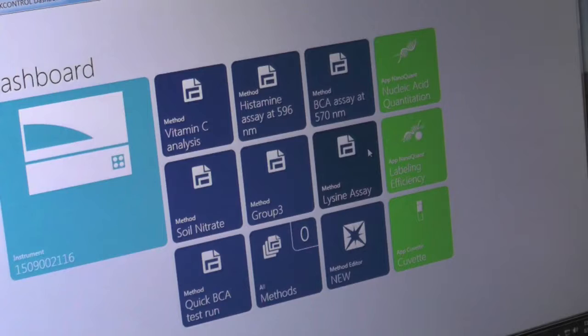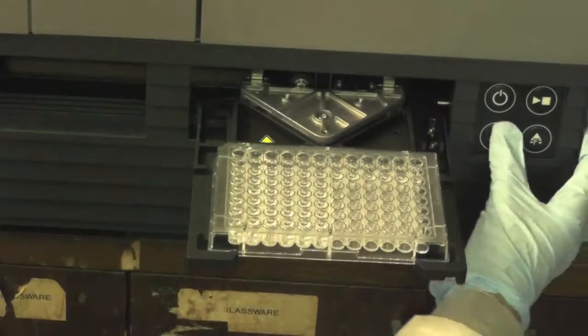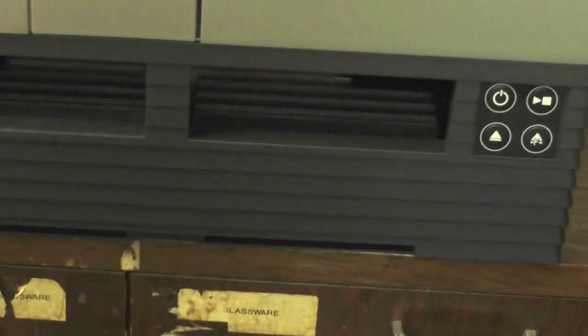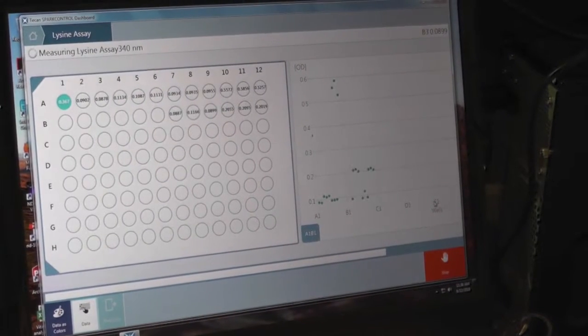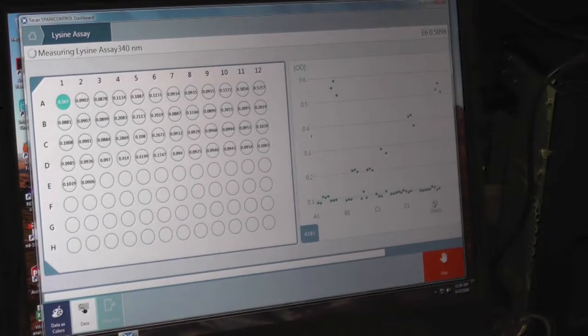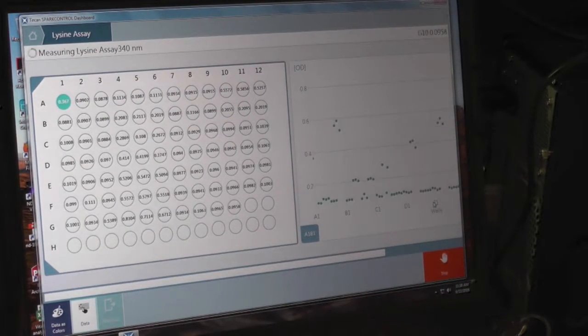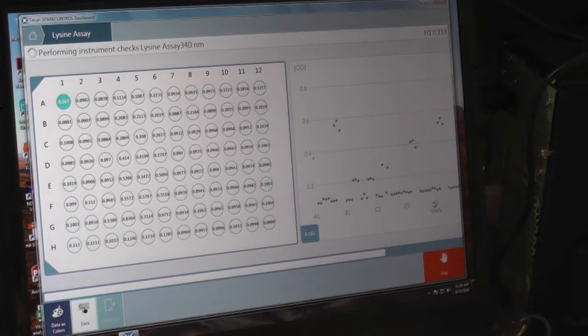After the incubation, read the plate using the preset program Lysine Assay on the T-CAN spectrophotometer. Save the results in Excel file with session number and group number on the computer and on your USB for further analysis.